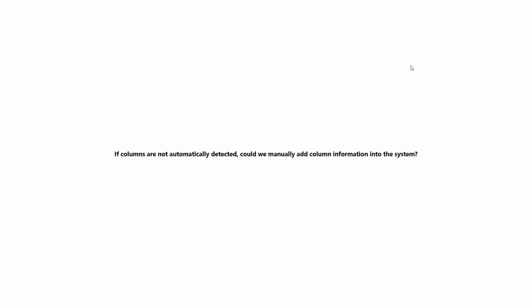And we have more column questions. Let's have our next question, please. The column question: you spoke about column tags that allow the detection of columns. The question is, will there ever be a potential to add an E-tag to non-Waters columns for tracking purposes? Many people have asked this question. I don't know the answer to that, unfortunately.